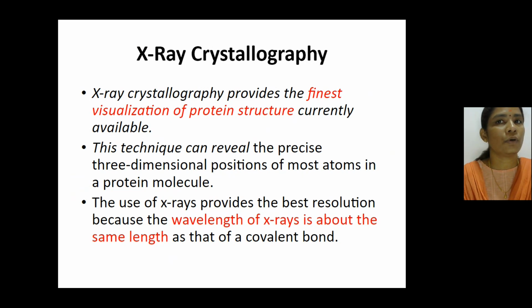So you have to understand why we are using X-rays to solve the structure of a protein. It is not that only protein structure can be solved; even nucleic acid structure and RNA structure can also be solved using X-ray crystallography.